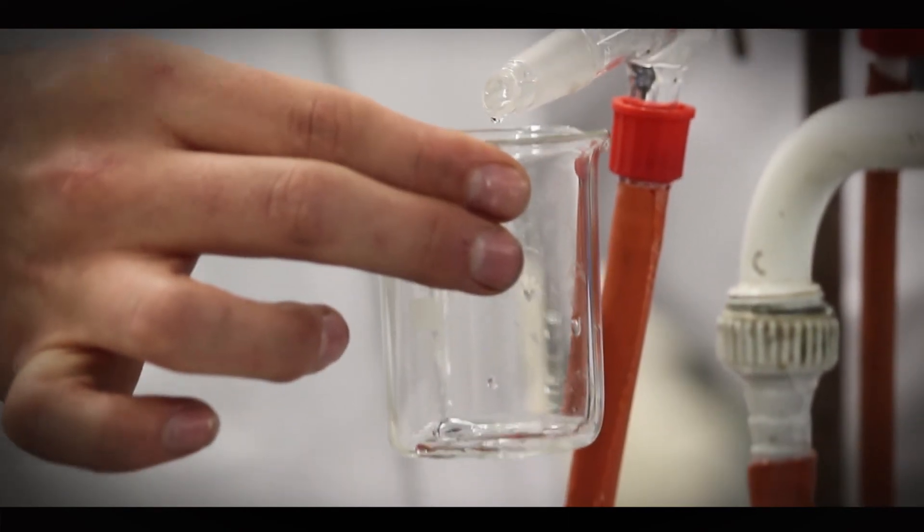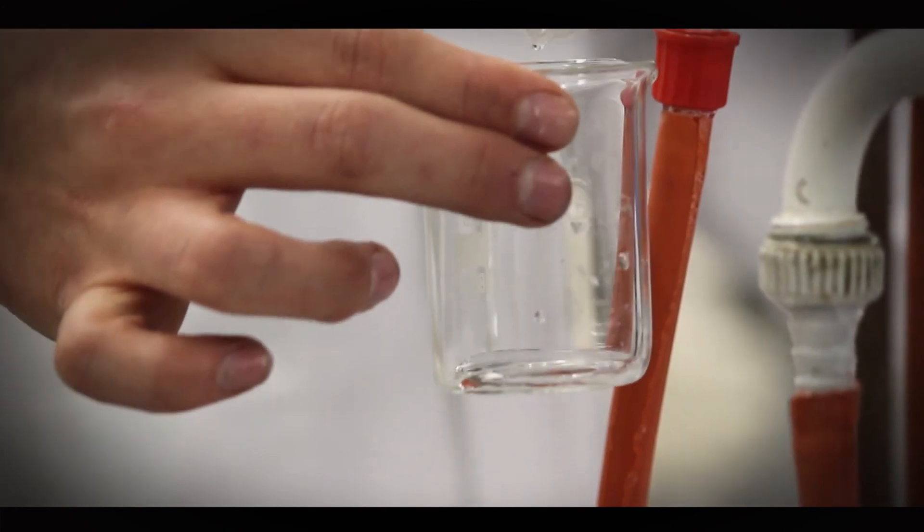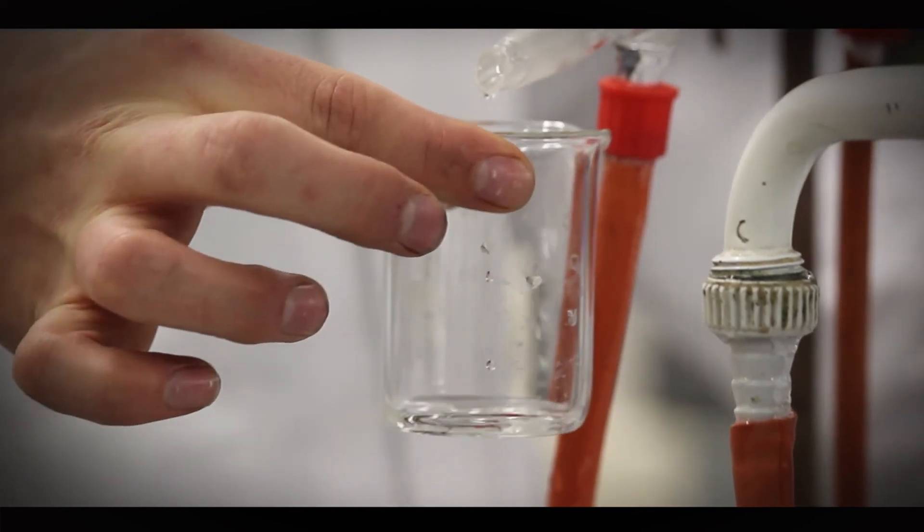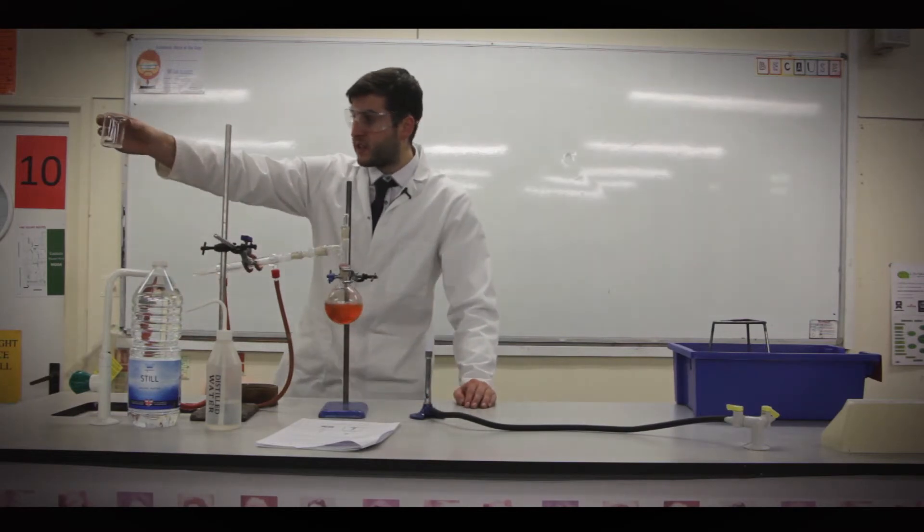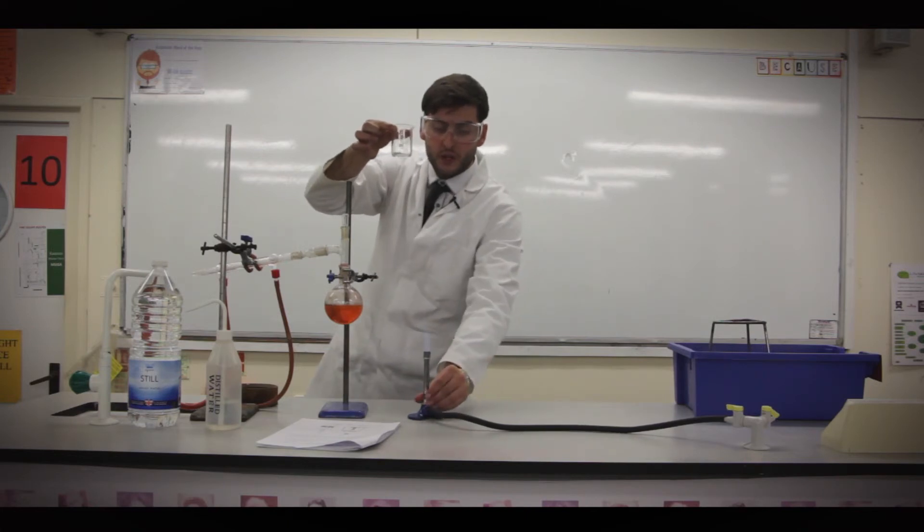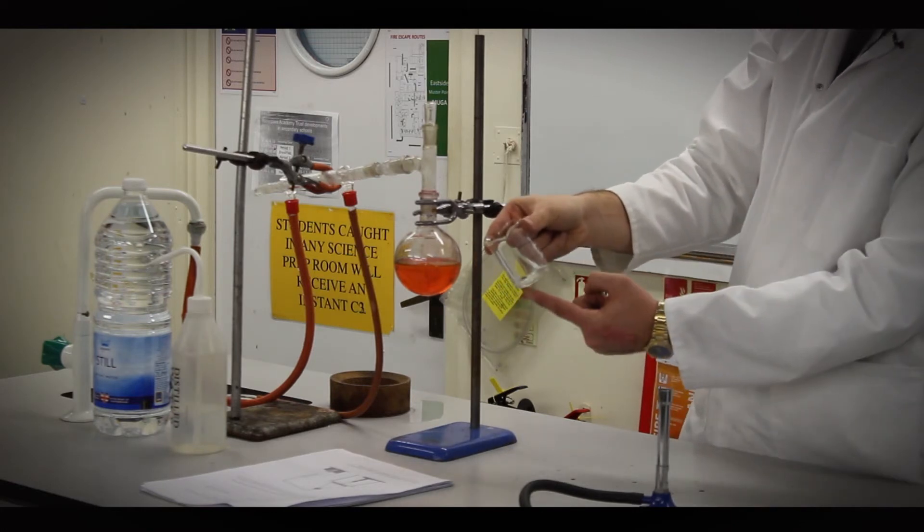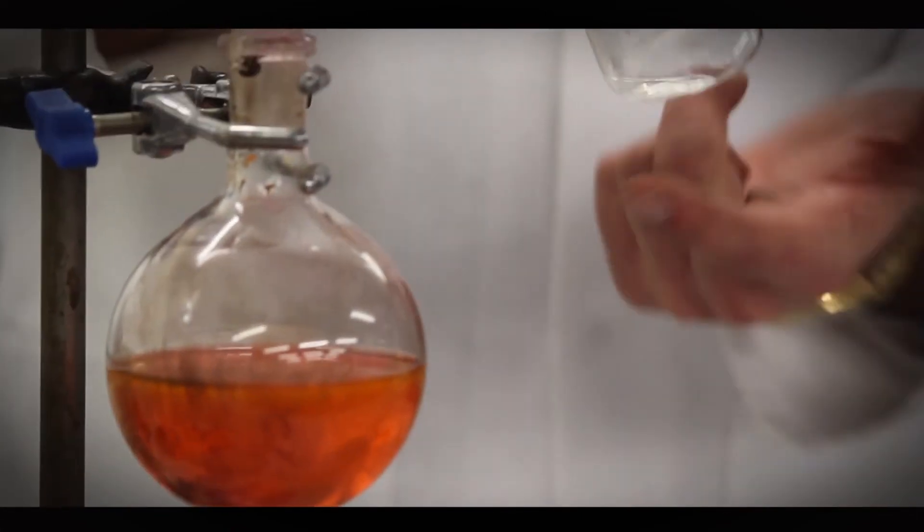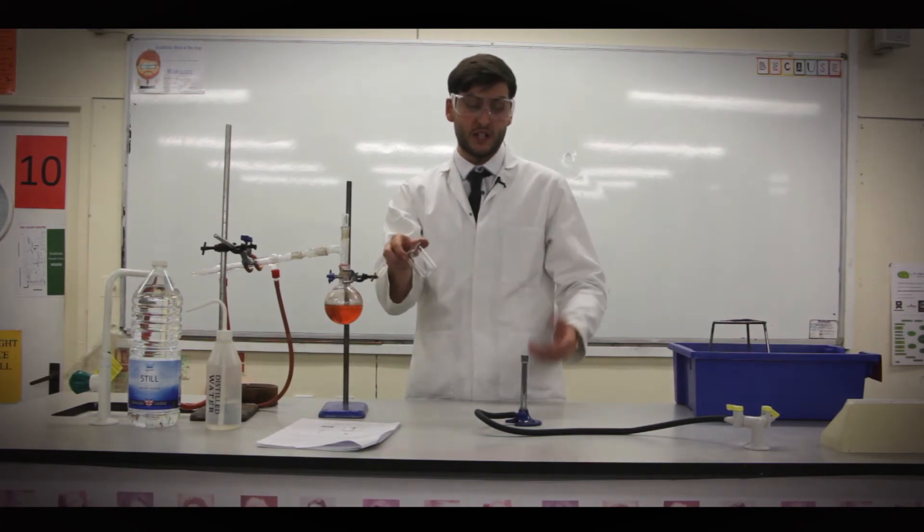And this is actually how we make distilled water, it's just in a quicker kind of apparatus in the lab. And you could keep going on this until all of the liquid has evaporated. Now I'm just going to stop it there. But the key thing is the mixture. That is now distilled water. And you can compare it to the mixture. It's clearly different. Now I know that's not a huge amount, but that's because I wasn't doing it for that long. But you could in theory use this now as distilled water for a titration practical or any practicals that require distilled water.